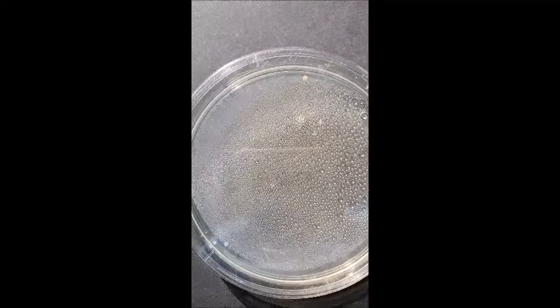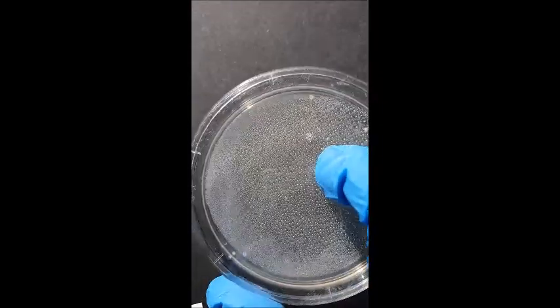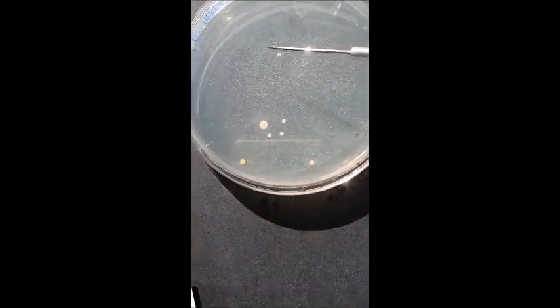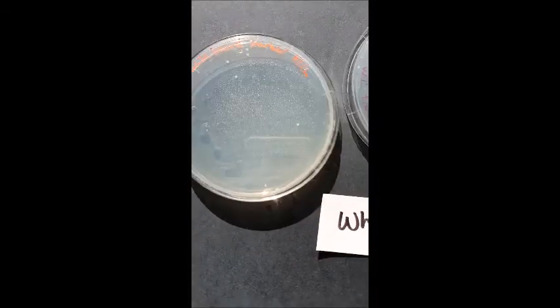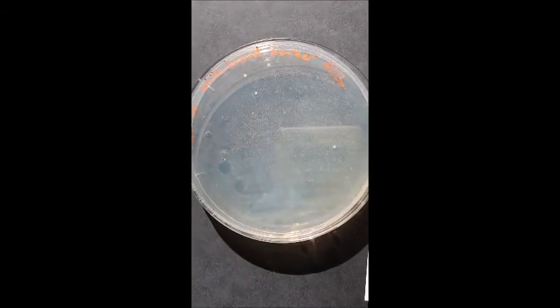It's hard to see through the condensation. I'll just quickly take it off. Ooh, it's scary. So they're quite shiny. And then the other whiteboard marker. This one looks like the same kind of bacteria.